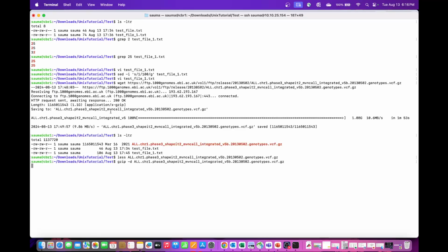See, here also, while you're downloading, it is saying it's a gzip file. So there are other places where you can also check what kind of compression the file has gone through. According to that, you need to uncompress. If, for example, it's a gzip file and you want to unzip it using the bgzip software, it won't work like that, right? It'll give an error or it'll create a corrupted file or something like that. So you need to know what kind of zipping has been done on the file, and then you can do the similar decompressing of the file.